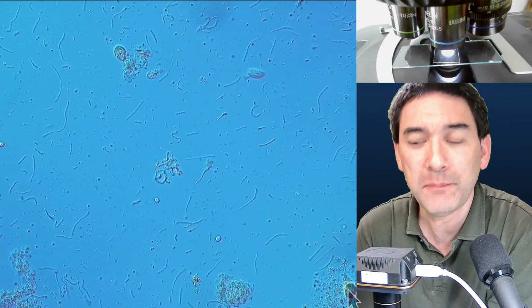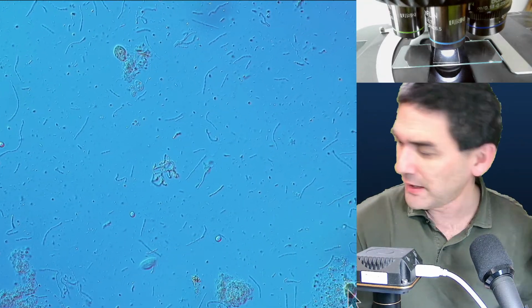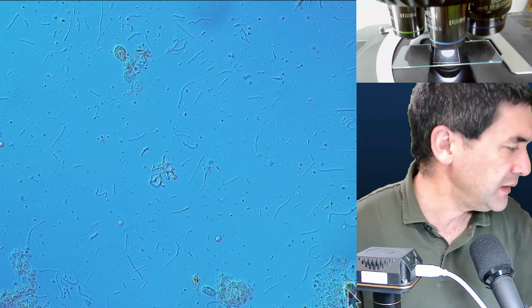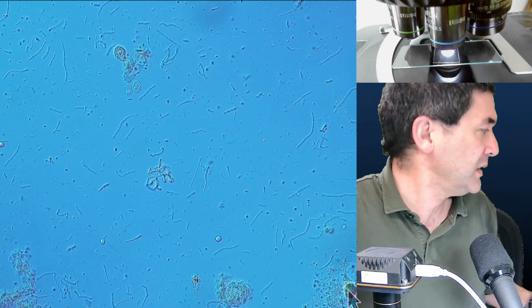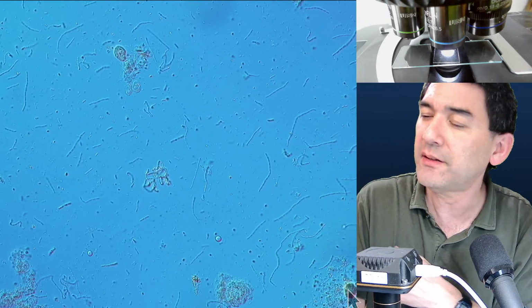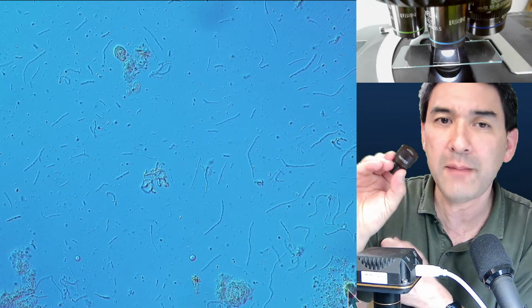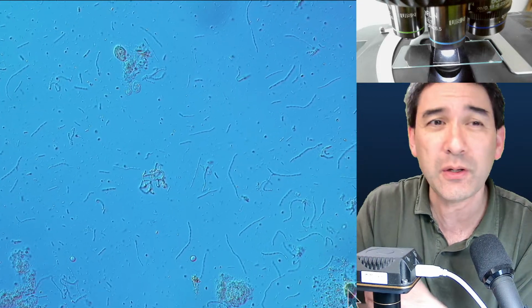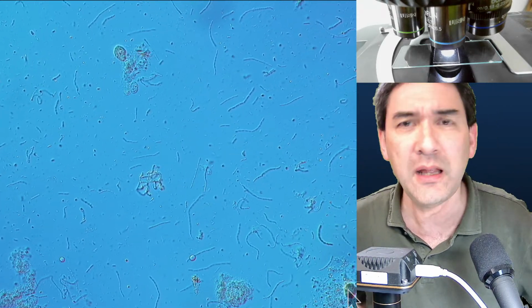However, when people say that they magnify 2,000 times, sometimes what they do is use eyepieces that magnify more. For example, this one only magnifies 15 times, but there are eyepieces that magnify 25 times, and this way you can artificially blow up the magnification. It's just a marketing thing.